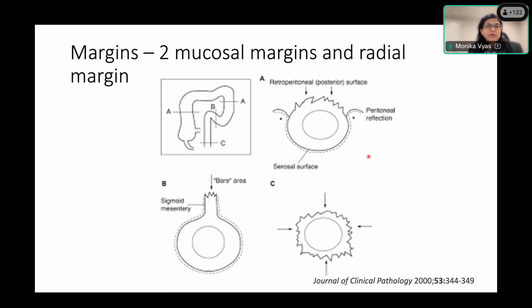Now, some parts of the GI tract are not invested by serosa completely, right? So on the right side, you have areas where the bowel is completely sitting on the retroperitoneal soft tissue without a layer of serosa. So that is where the surgeon will have to go around the soft tissue and cut it. So this would be a specimen that's partially invested by serosa. So it will have a serosal edge, and it will also have a radial or circumferential margin.